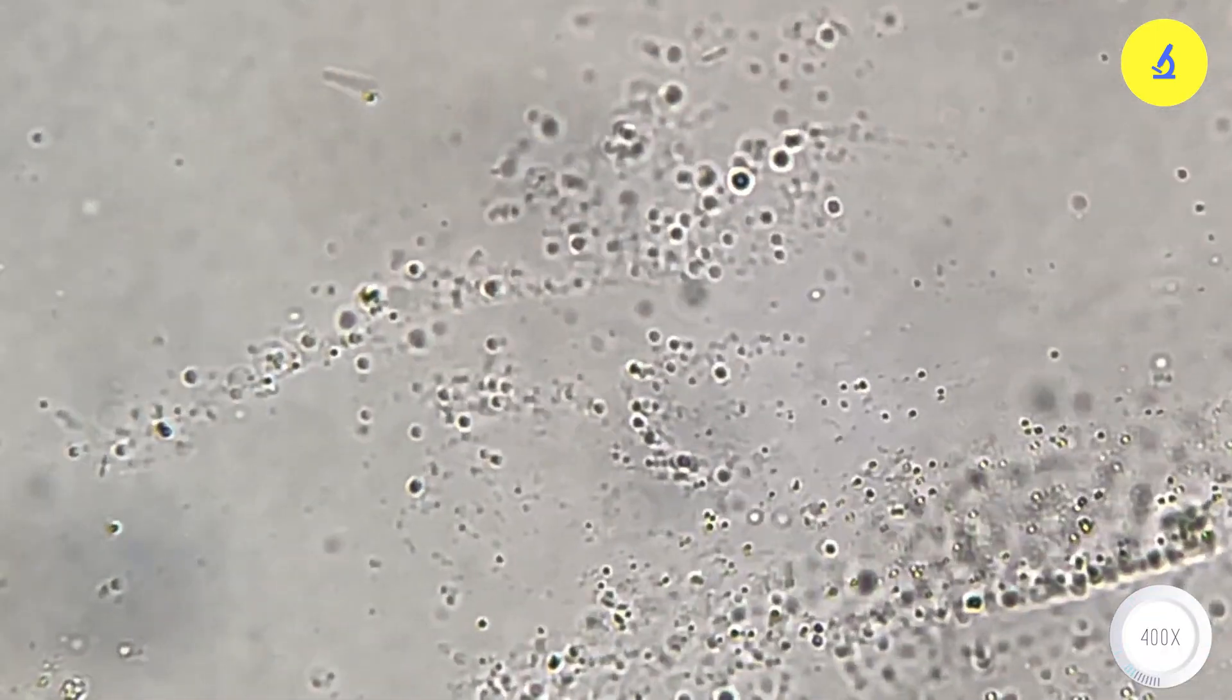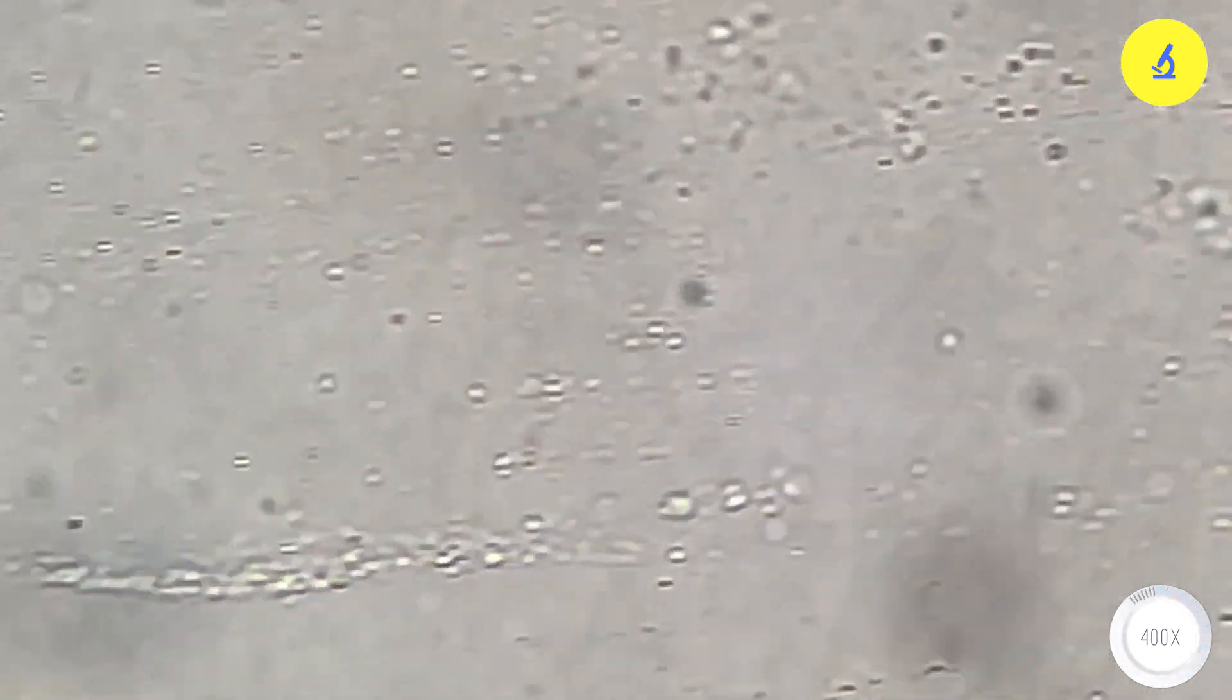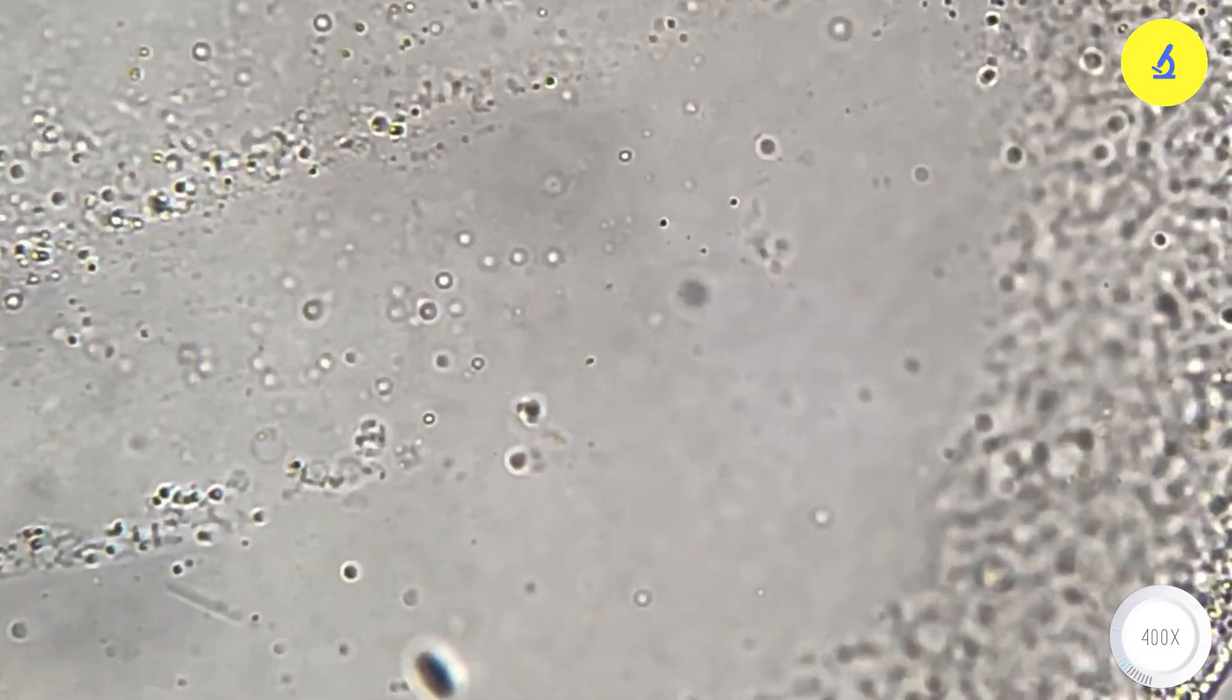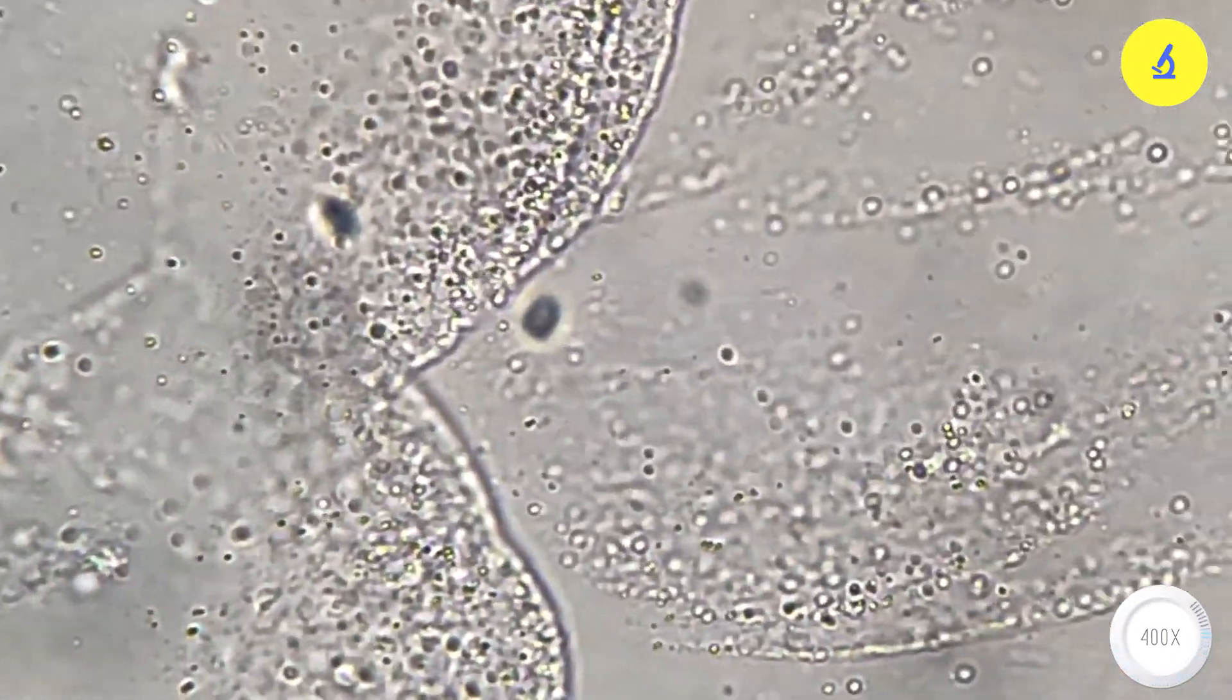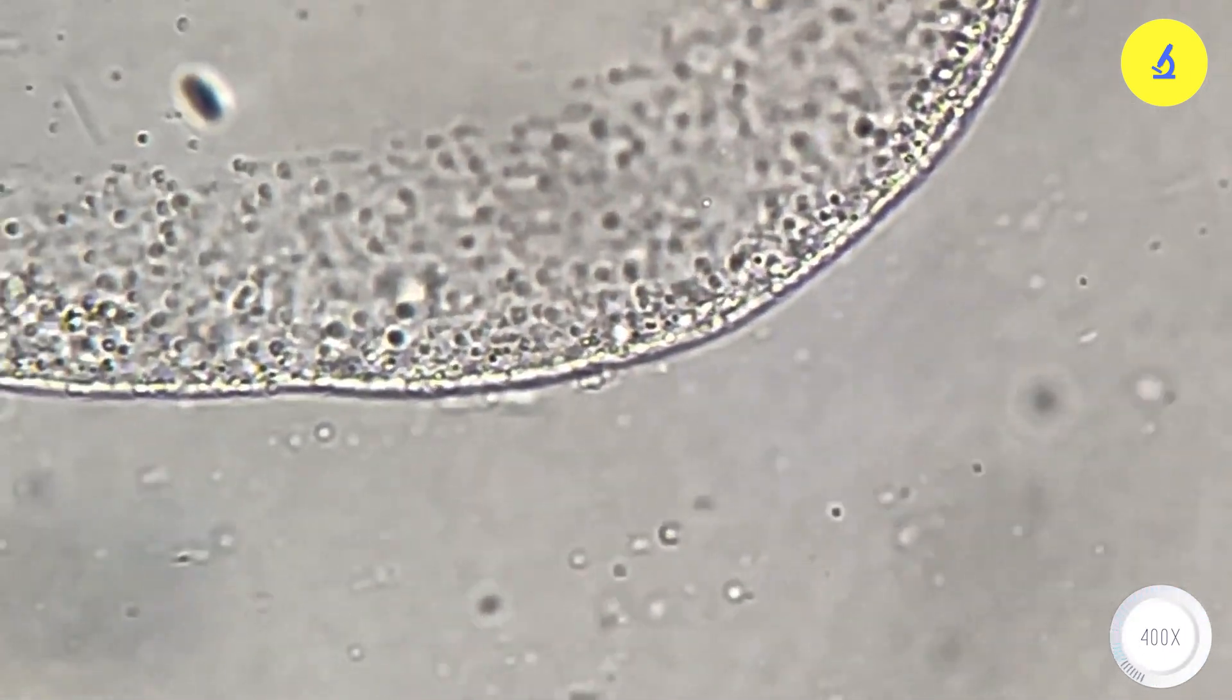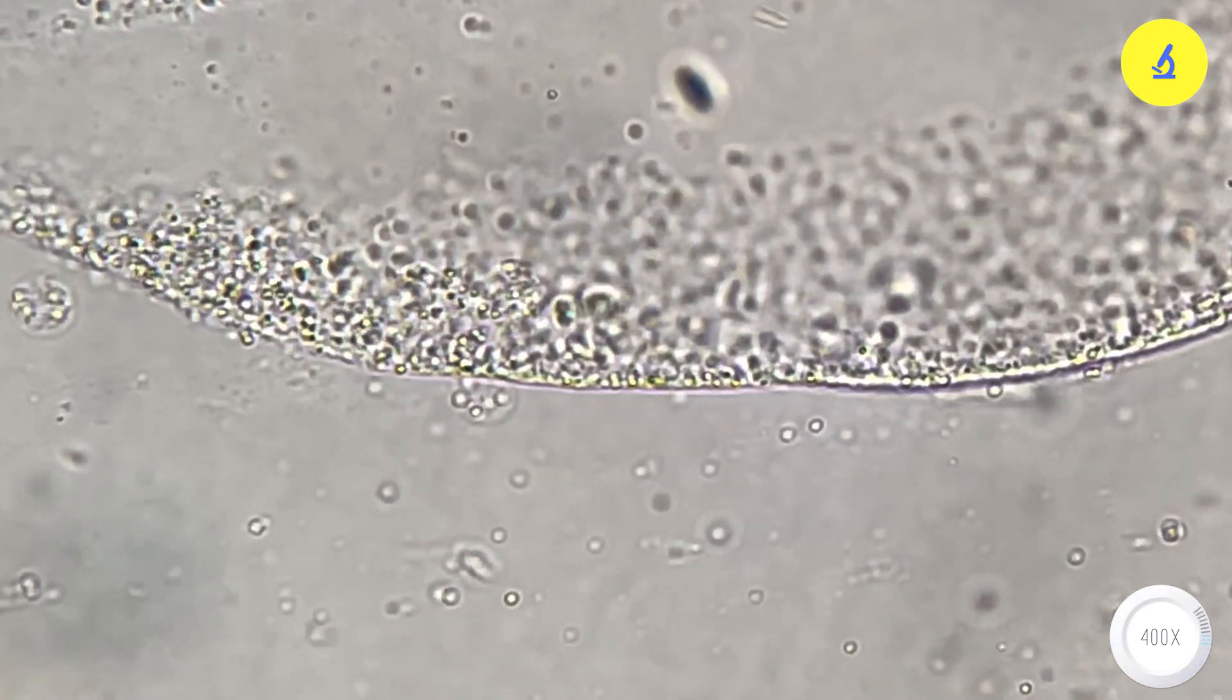Here is an image magnified 400 times. We are observing a piece of cell in the gut of a leech, with many bacteria actively working. Especially, the gut of a leech will continuously develop gut fragments along with a closed circulatory system, not excreting waste but with a type of bacteria called Aeromonas hydrophila that helps digest blood and produce an antibiotic to kill other bacteria that cause decay. It sounds really bizarre, doesn't it?